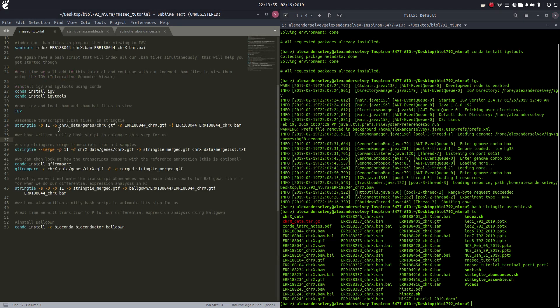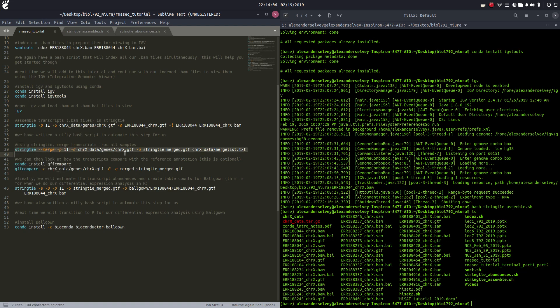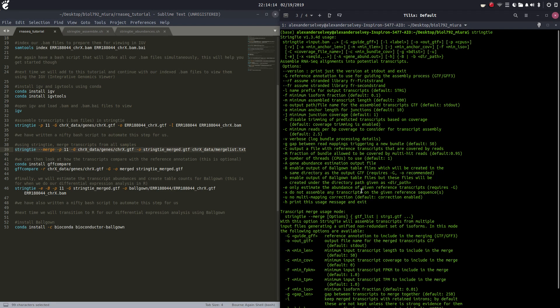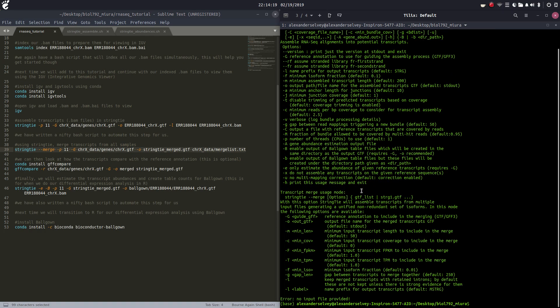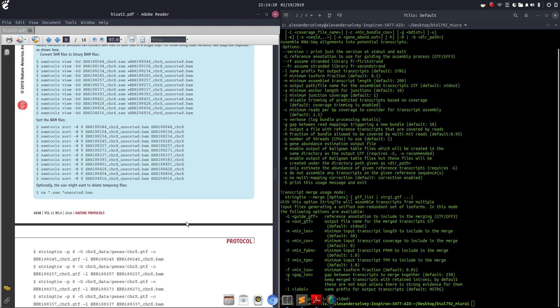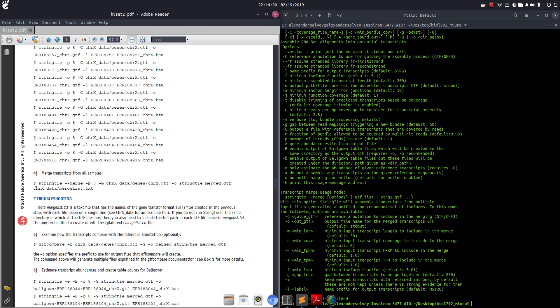Let's move on to the next step. Using StringTie, we're going to merge all the transcripts from all samples using this command: stringtie --merge. Let's view our manual. StringTie --merge will merge all of these. If we go to our protocol, this is the command that they use.